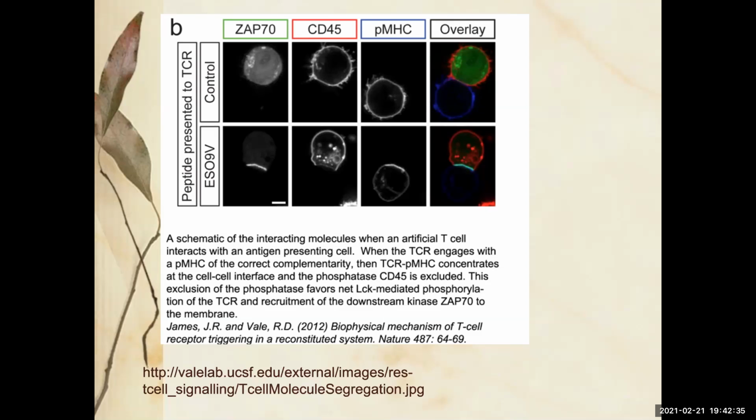It's the same thing. It's the same channels. This is also the name of the protein that they're actually looking at, but notice they've put the green, red, and blue little boxes around it, so you can be reminded that although you're seeing it in black and white, it was actually in real life green, red, or blue. And here you go back with the color. You might be saying, where's the blue? I love this image too, because it's so dim, but it's there.